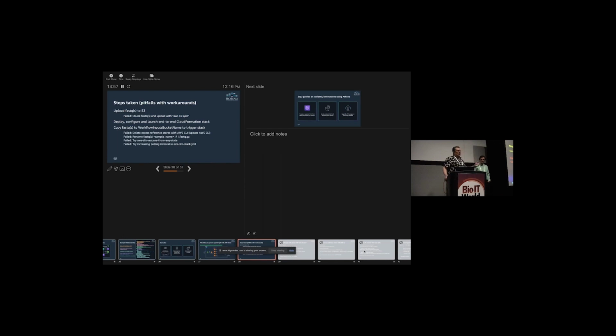So I just used the old timer trick of using split and cat. I chunked it up into 100 megabyte pieces, then used AWS Sync to pull it up, and a couple of them failed, but then you just run it one more time, and then 2 seconds later it's up. So that was a useful trick, an old timer trick.